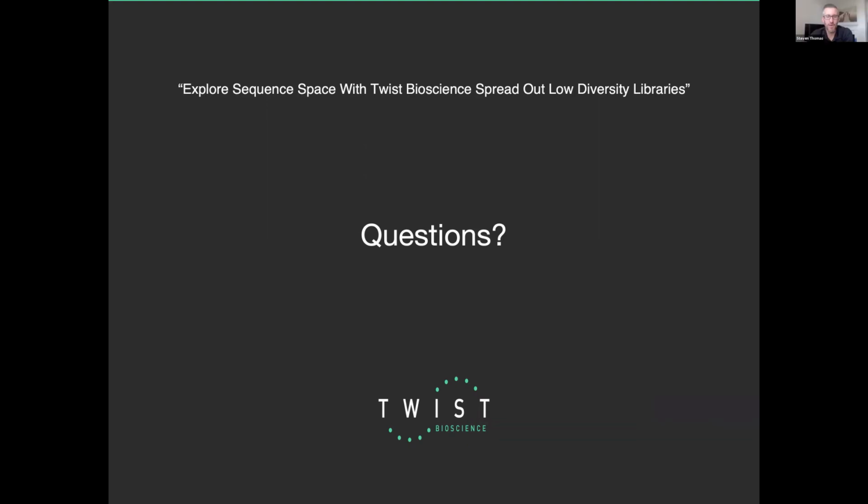Okay, so there's a few more questions along that similar idea in terms of limitations around design. So I don't think we need to go through each one. Essentially, 10 to the 8 is the maximum diversity spec for these libraries, and how that diversity is spread around is in theory limitless, but is basically design dependent. So we would encourage you to reach out to us at libraries@twistbioscience.com.